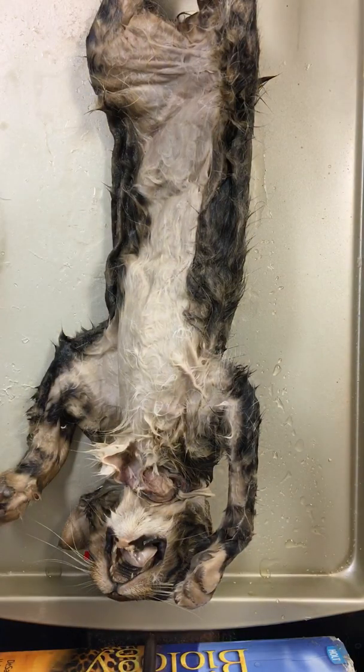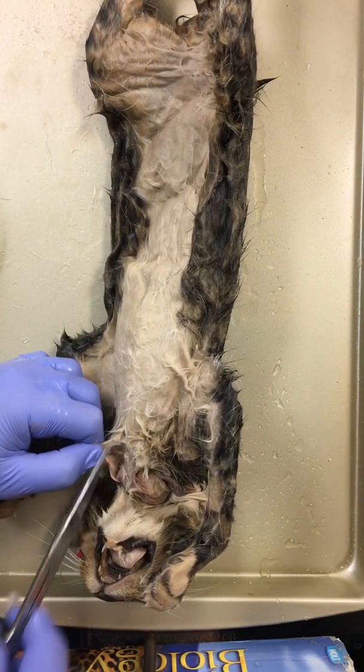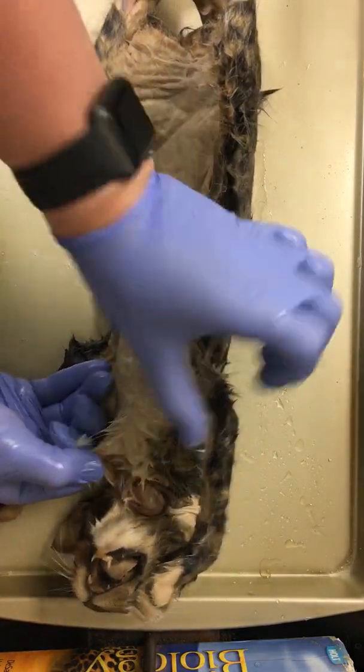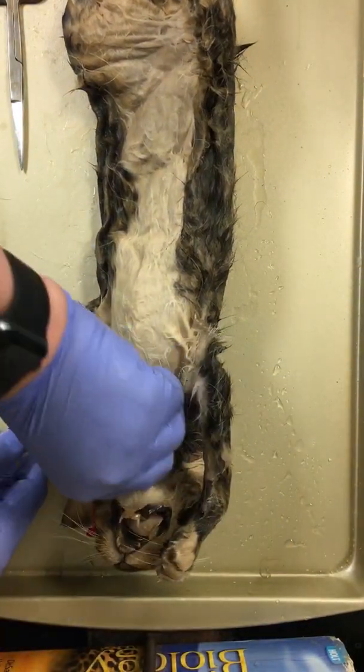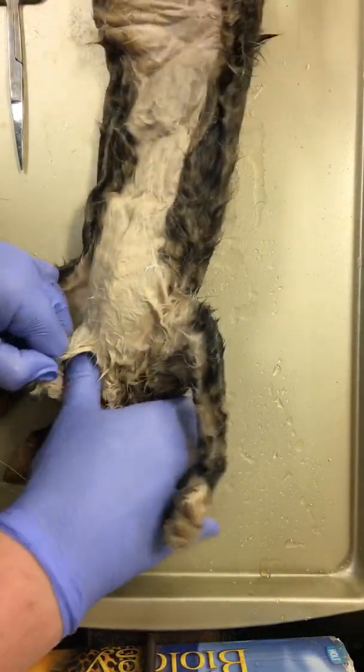We want to stay very superficial when we're cutting this because we don't want to get into our muscle layer. We're actually going to take our thumb — this is a blunt dissection — and we're pushing that layer, the connective tissue, away from the subcutaneous layer.